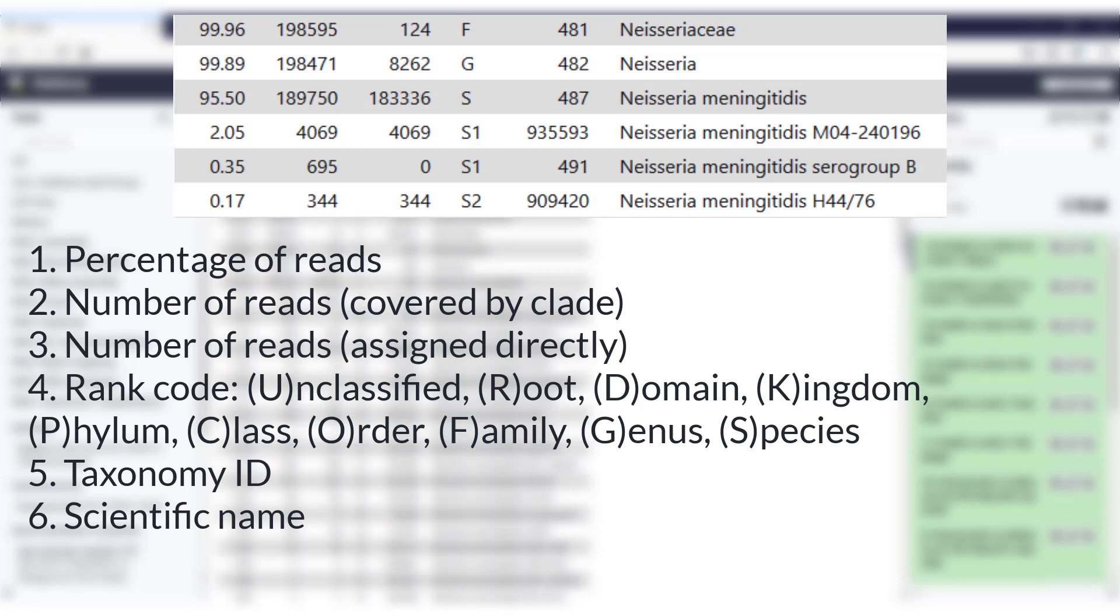In the fourth column, we find the rank code. There are 10 default ones, and they start with U for unclassified, R for root, K for kingdom, and all the way down to S for species. Sometimes you will see a number behind one of these rank codes. This means that the taxonomic rank does not belong to one of the 10 default ones. Instead, it uses the rank code of the closest ancestor and adds a number to indicate the distance from that rank. So S2 means that this is below the species level, and that the grandfather of that rank is at the species rank.